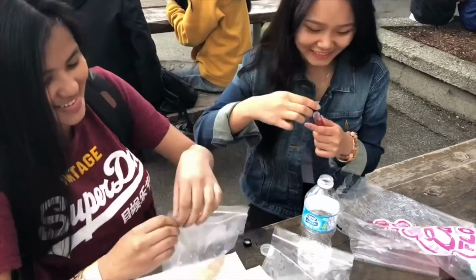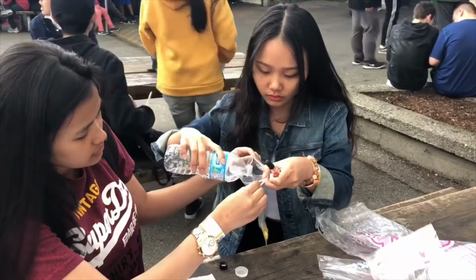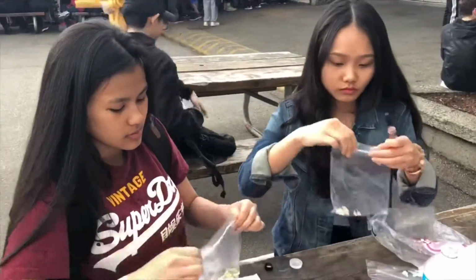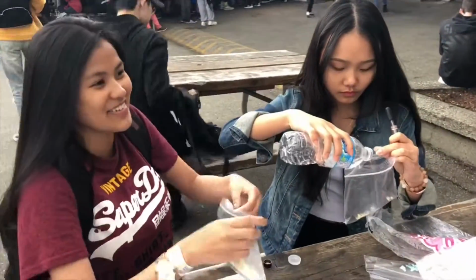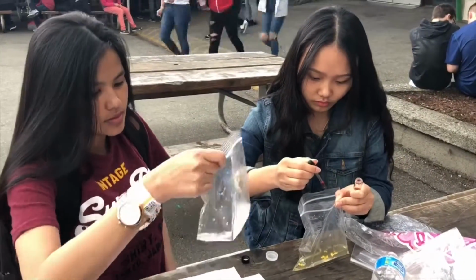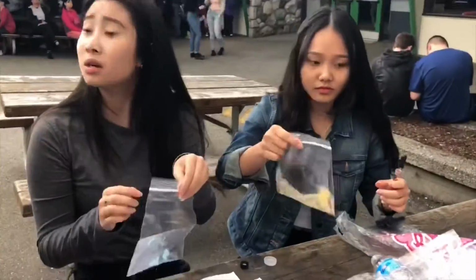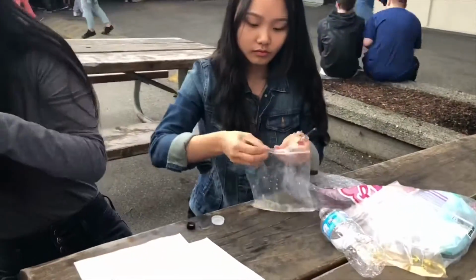Each food sample was broken into smaller pieces and placed in its own plastic bag. We then added a bit of water and 3 drops of Sudan stain. After each bag had been filled with its own food sample, water, and 3 drops of Sudan stain, we shook them gently to make sure it mixed well. Finally, we let it sit.